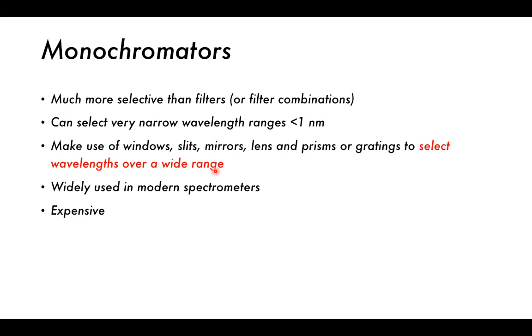There's no problem, the same monochromator can measure light maybe at 100 nanometers, at 200, at 300, even 1,000 nanometers. But every time it measures, it's only really measuring that wavelength. So it can tell the difference between 100 and 102 nanometers, the difference between those two different wavelengths and the light that's absorbed there or the light that's emitted there.